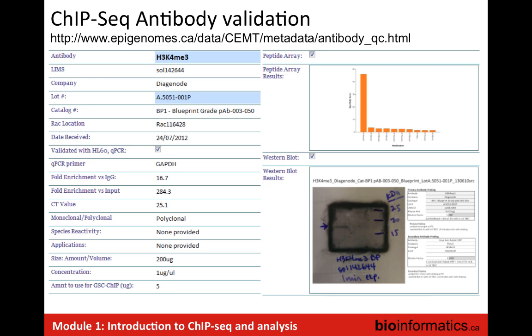However, I would argue that if you're going to do ChIP sequencing, you should use paired end reads. The reason for that is because it allows you to define the fragment size. When ChIP sequencing was first developed, we and others developed this computational extension where we would take from the lab the actual distribution that we loaded onto the sequencer, and we'd computationally extend the single end read to the average fragment length. That has some issues, and I think Misha might talk about some of that in the alignments.